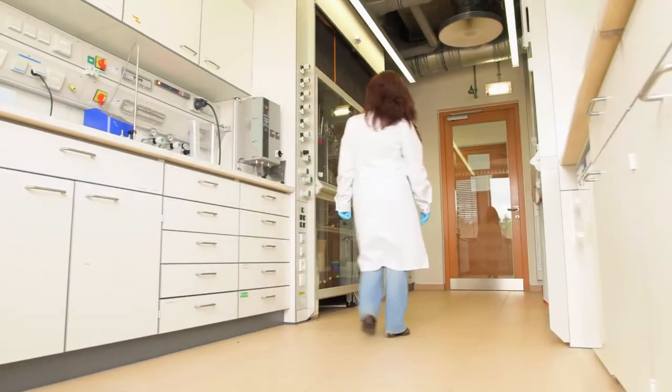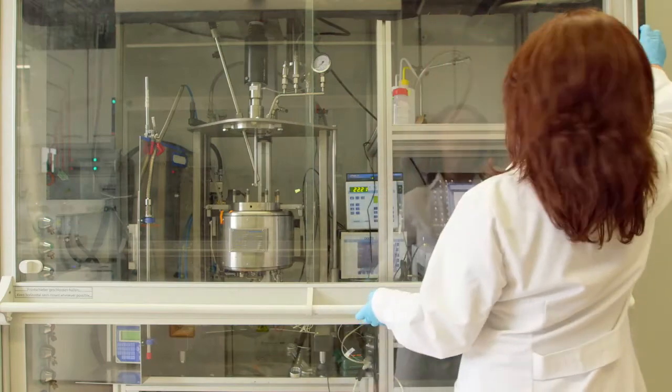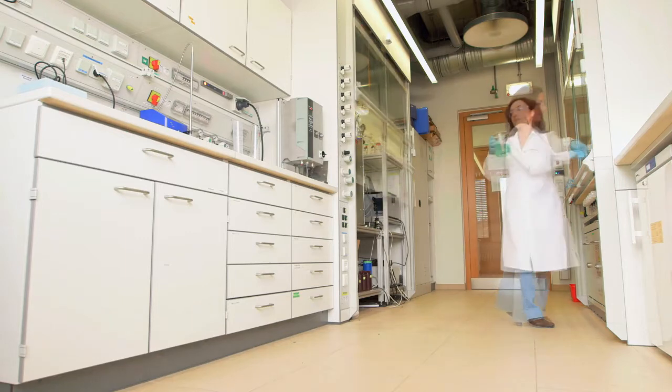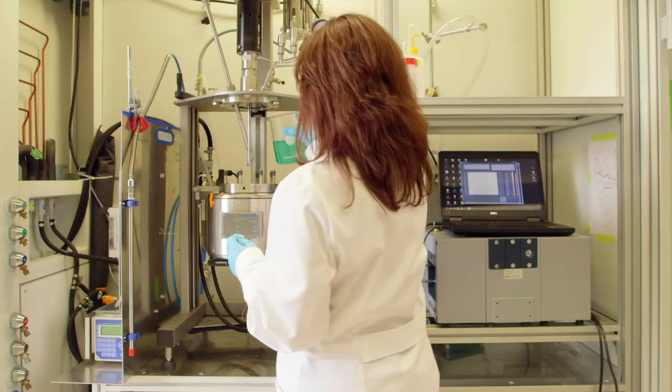Monica Di Staso applies an alternative method for producing particles. She works with the bottom-up solvothermal production method and synthesizes custom-made particles.